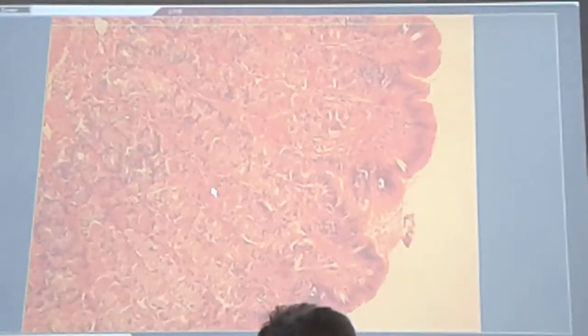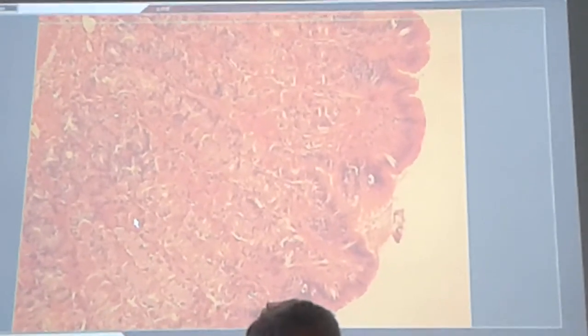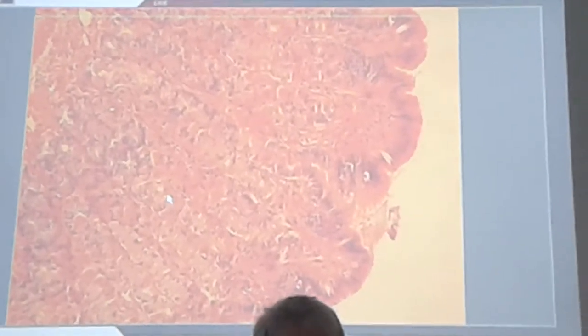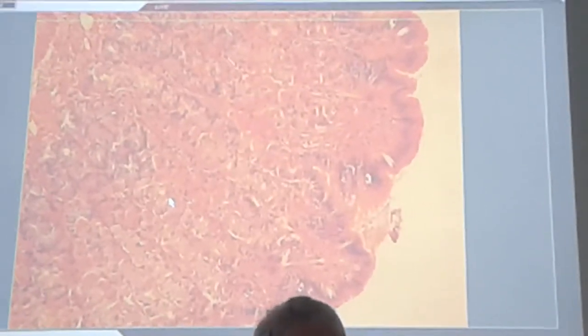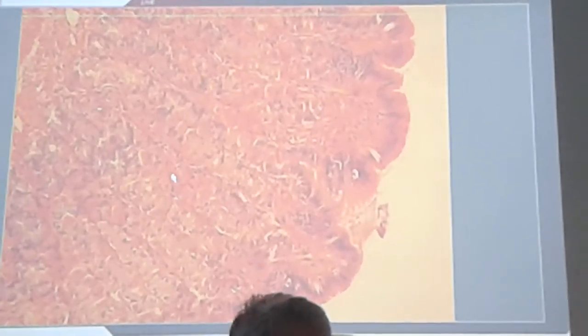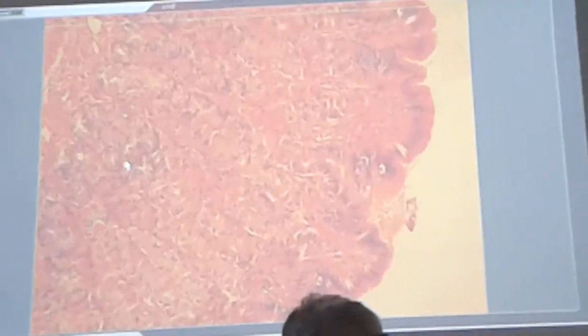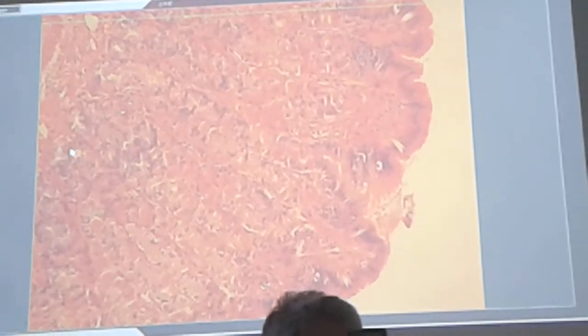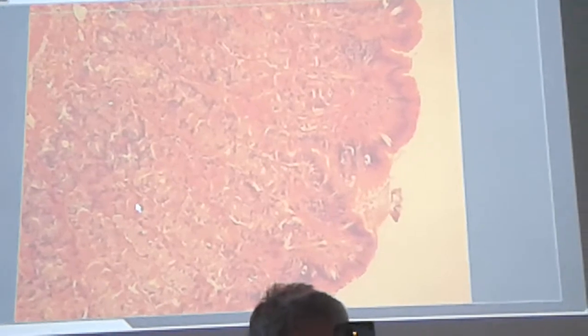As you see, some of the cells are stained more eosinophilically, more pinkish or reddish cytoplasms. They are very well characteristic of the parietal cells. Those parietal cells I'm pointing to are the more pinkish, reddish cells. But some other, more basophilic staining cells are also present. When we go deeper through the glands, they are the next cells, which we call chief cells. The chief cells are more basophilic, but the parietal cells are more eosinophilic staining.